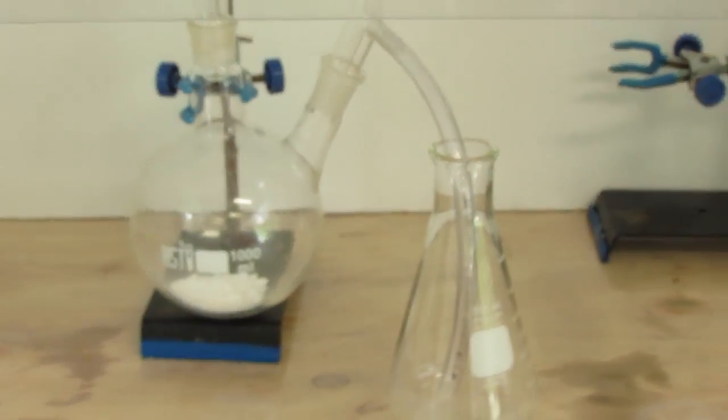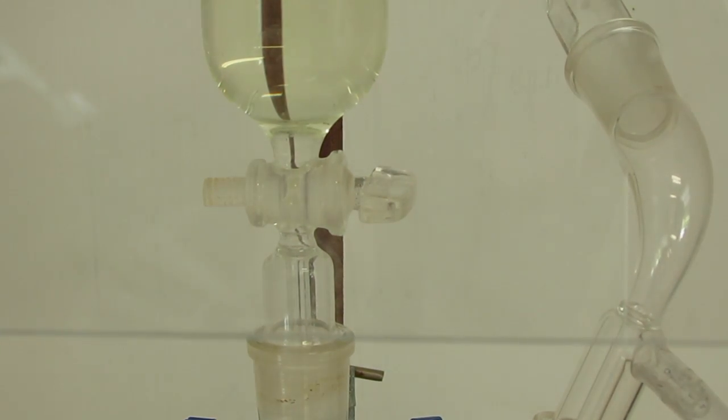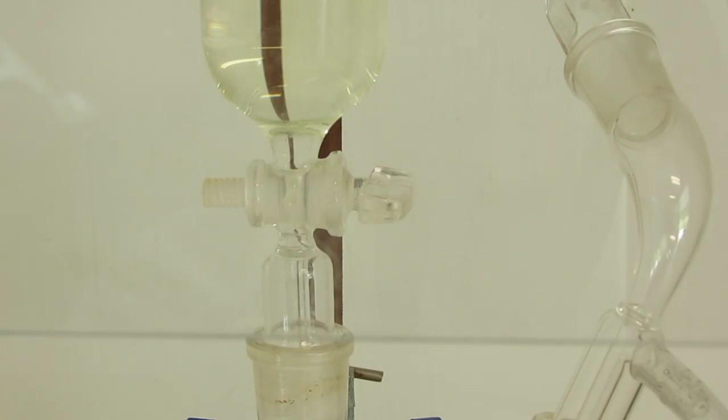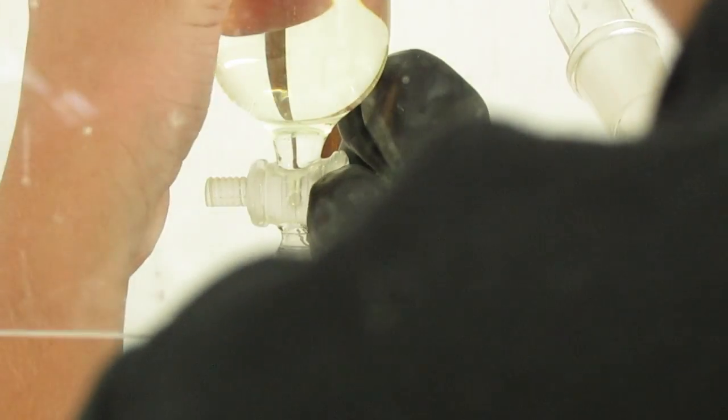Then I have on the second arm there, I have a vacuum receiver that I have the end stoppered off so that I can attach a hose to it that will lead the chlorine gas into a flask. Here I am just starting the addition of hydrochloric acid.